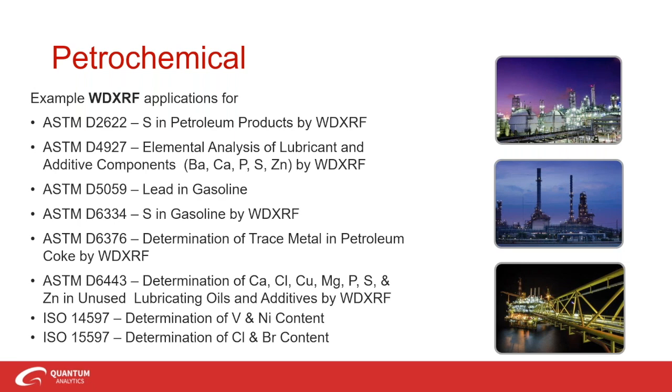Current fuel sulfur standards in some countries are already as low as 10 ppm. It's probably going to get lower as we go, and other countries are catching up. XRF instrumentation can achieve these low levels of quantification with excellent precision. XRF is commonly used to validate the formulation of oil additives and also look at the control of wear metals in some of these running processes.